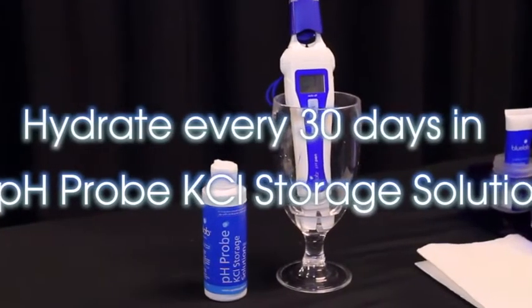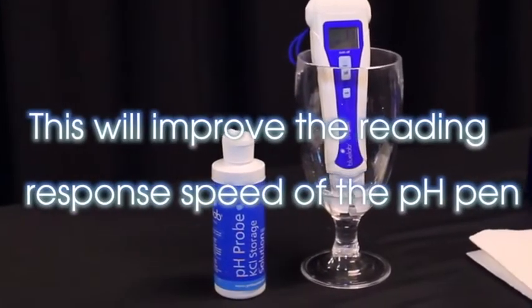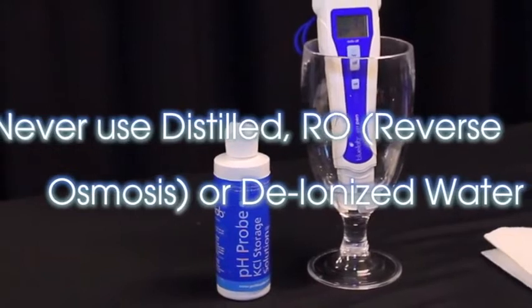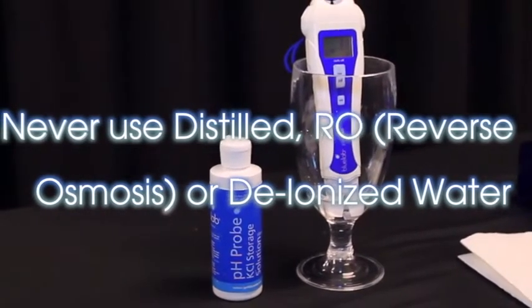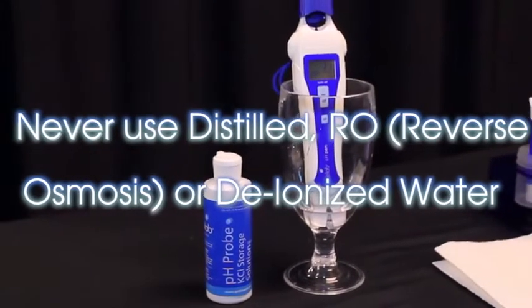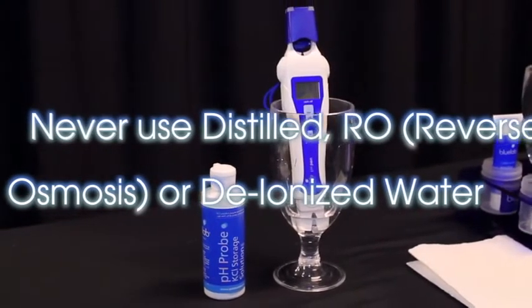Hydrating the probe before first use and every 30 days in KCL solution improves the reading response speed of the pH pen. Never use distilled, RO, or deionized water to hydrate or store the pH pen. Pure water like these changes the chemistry in the reference, causing the probe to die.